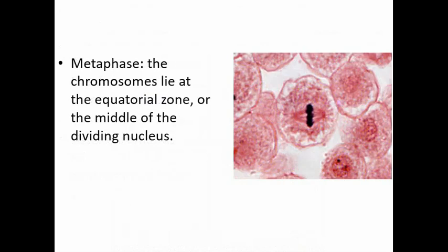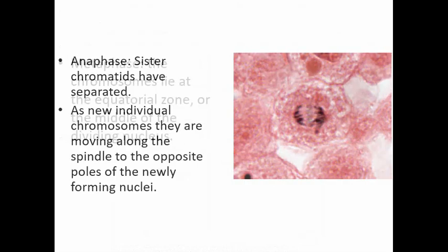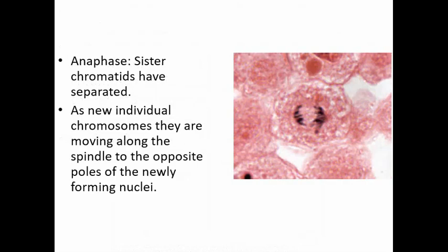In metaphase you'll see the chromosomes are lying at the equatorial zone or the middle of the dividing nucleus. Then in anaphase you'll see a cell where the sister chromatids have separated. As these new individual chromosomes they are moving along the spindle to the opposite poles of the newly forming nuclei.